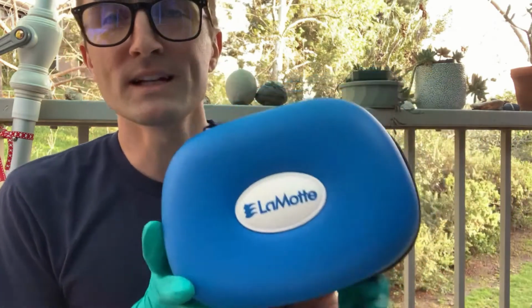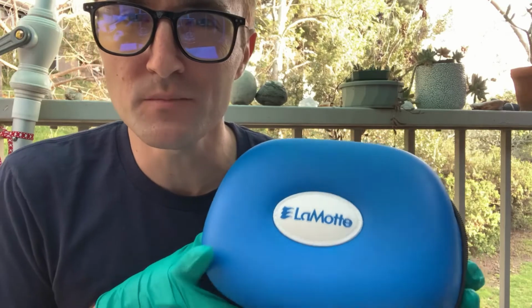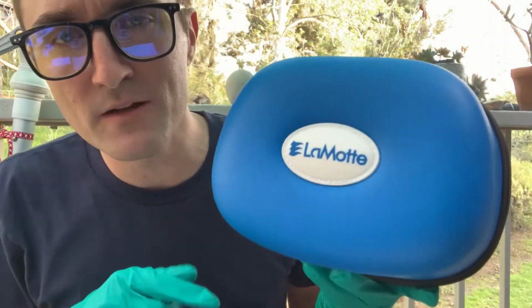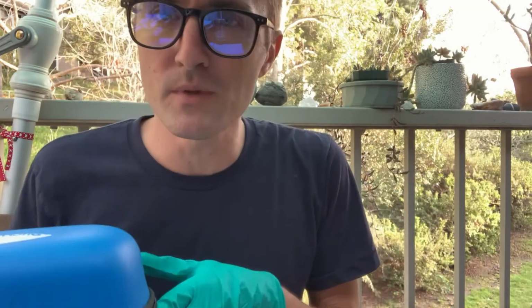It's time to do some chemical tests of our soil samples here. We're going to test the NPK, the nitrogen, phosphorus, and potassium today. We'll be using our LaMotte soil test kit. These are meant to be done outside in the field, so you don't need a laboratory, you don't need a kitchen, you don't really need much.